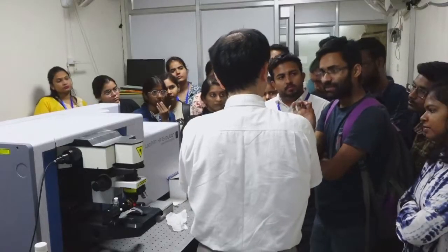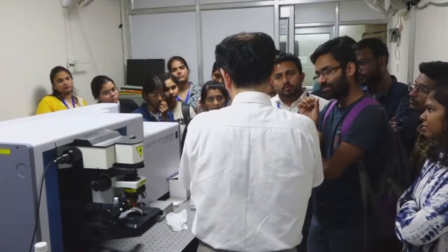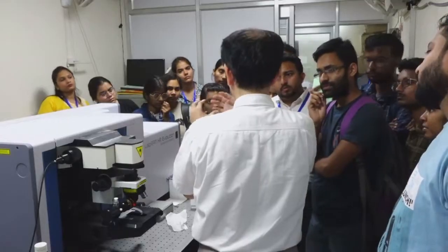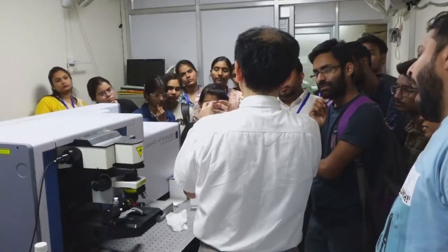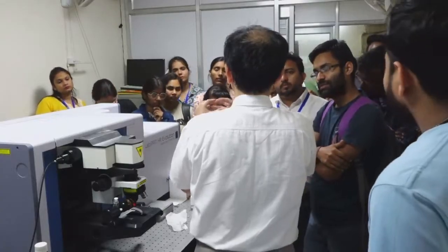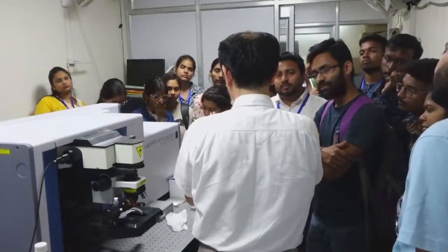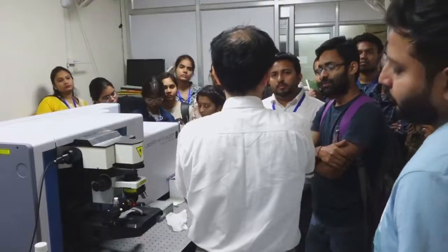So can we take the spectra of gaseous molecules? By preparing some container, glassware, and filling the gas. But the density of the gas molecule is very low. So typically they prepare a container for high pressure, increase the pressure, and measure the Raman spectrum. By doing so, we can increase the density of the gas molecules, and the Raman scattering signal becomes larger.